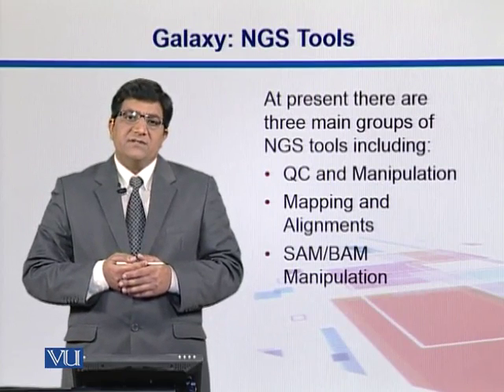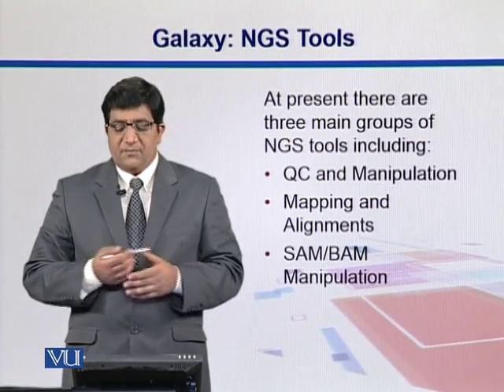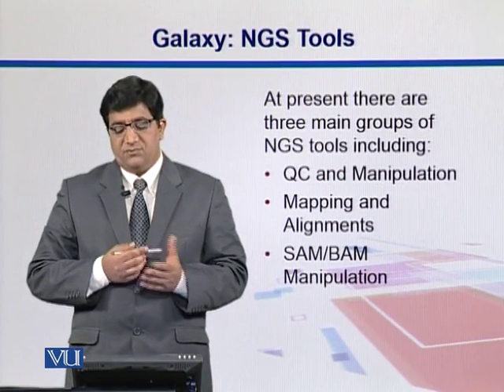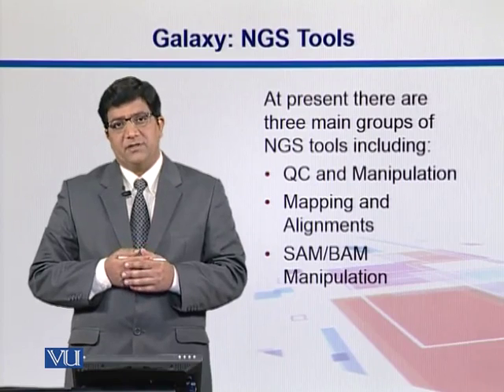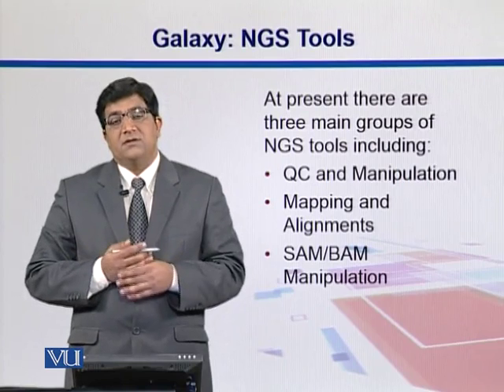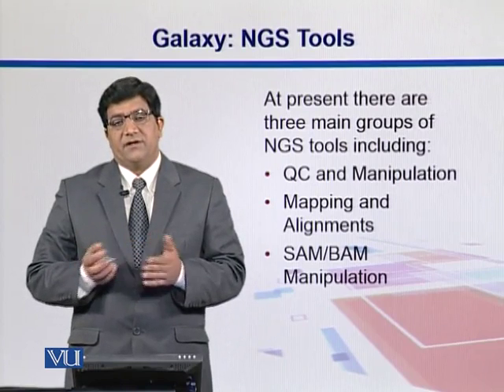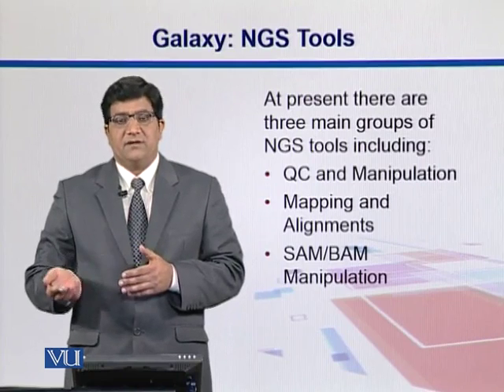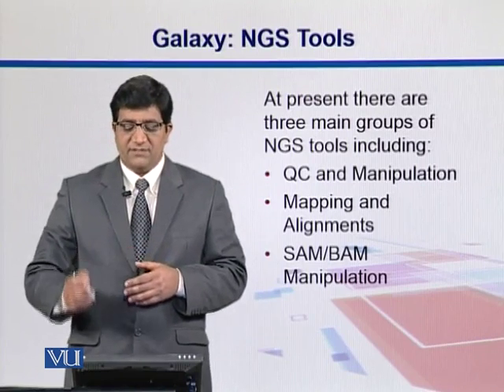As far as NGS data is concerned, the main tasks which Galaxy can help with are QC, the quality control, and manipulation. You can do some alignments. You can also convert or manipulate between different aligner outputs like SAM files and their BAM files, and you can visualize them.